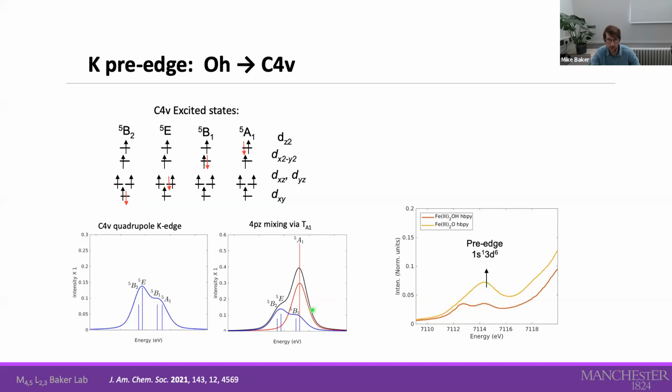We have some 4p mixing present that enhances the 3d z², resulting in this large uptake in intensity at that part of the spectrum. So you can see that the role of 4p mixing can both carry important information about large symmetry distortions from octahedral, but also make the interpretation more complex.